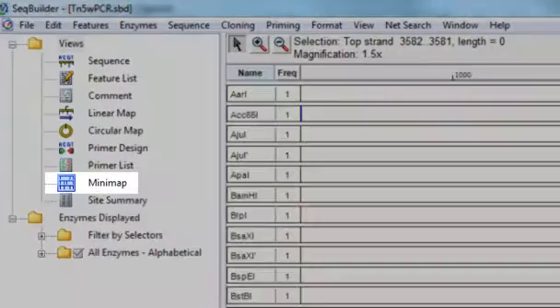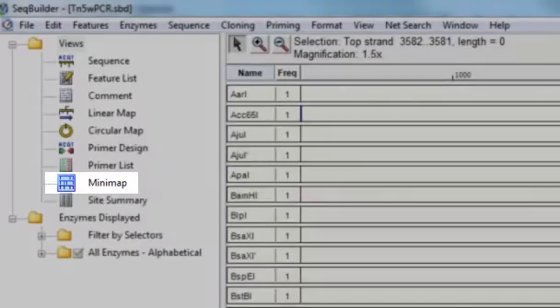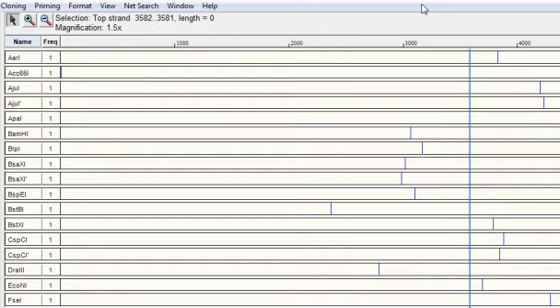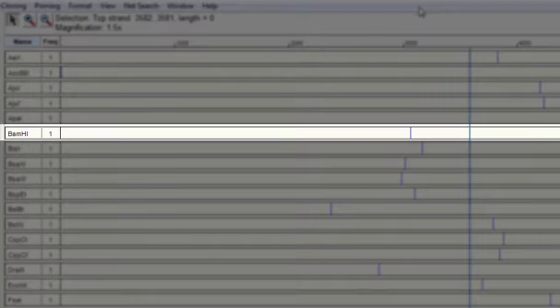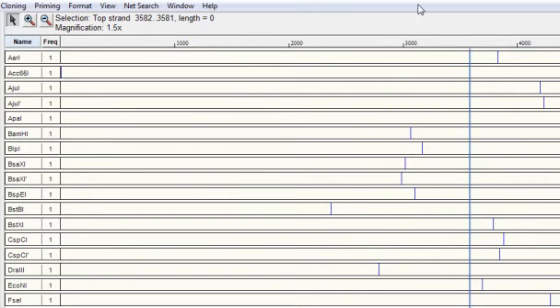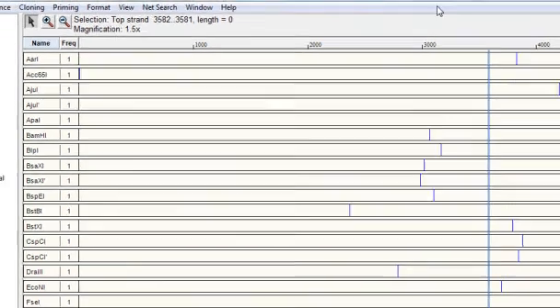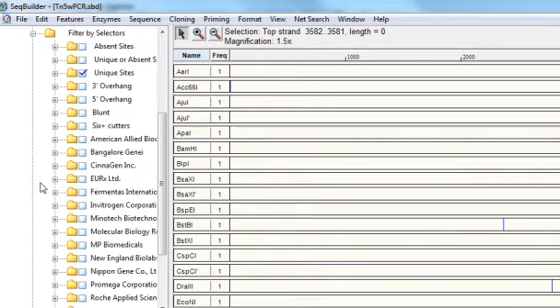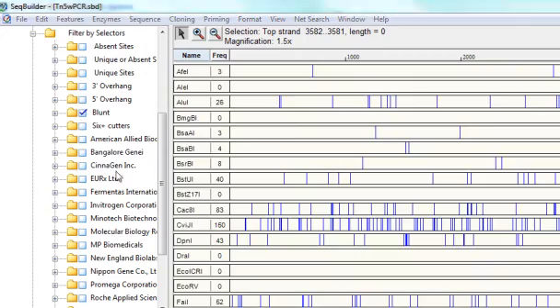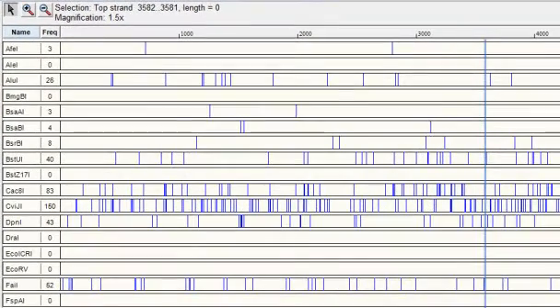The minimap view displays your nucleotide sequence on a smaller scale and in relation to restriction enzyme cut sites. Each row shows the cut sites for a particular enzyme along the sequence. Right now I'm only displaying unique enzymes, so we're seeing just one cut site per enzyme. But let's turn off the unique filter, and then turn on the filter for blunt cutters. And now we can see some difference in the frequency of cut sites.